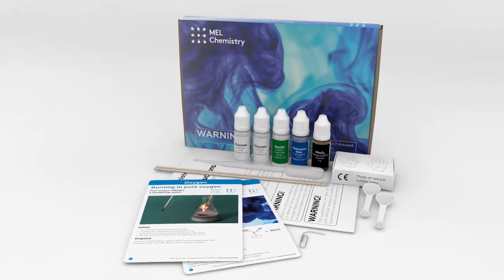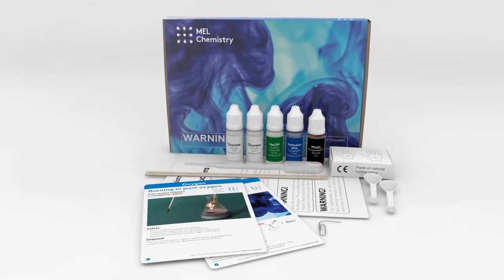Welcome to the wonderful world of chemistry! Today, with the help of the Oxygen Set by Mel Chemistry, we will create a solution which becomes blue when shaken and after a while becomes colorless again.